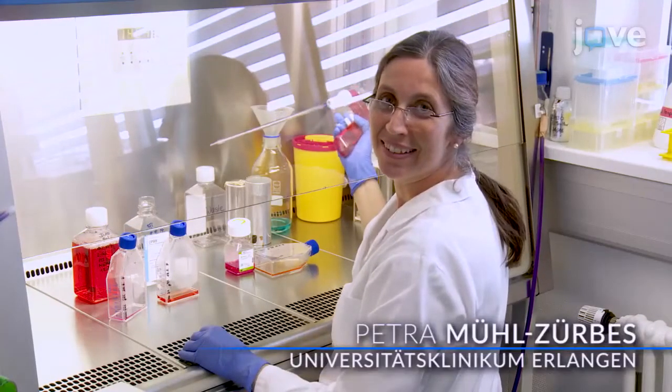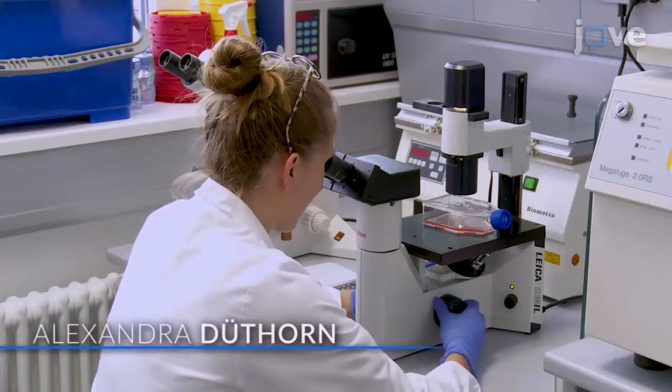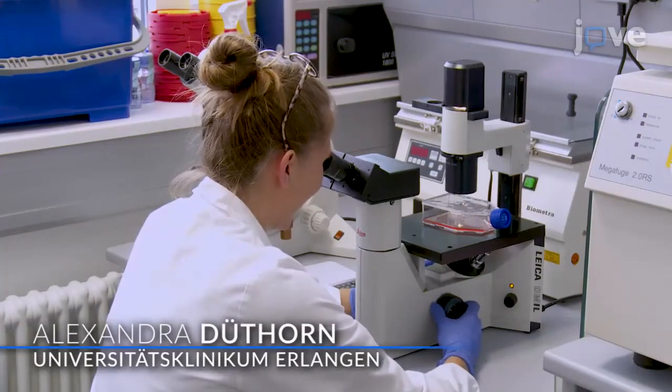Demonstrating the procedure will be Petra Mul-Turbes, a technician, and Alexandra Duthorne, a grad student from my laboratory.